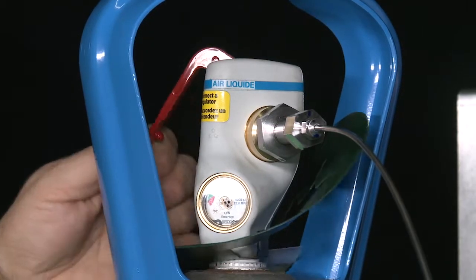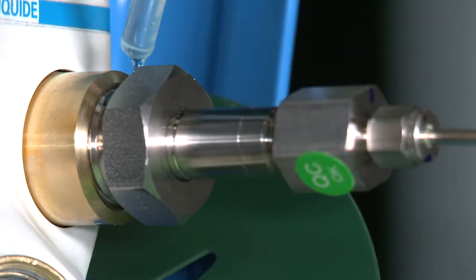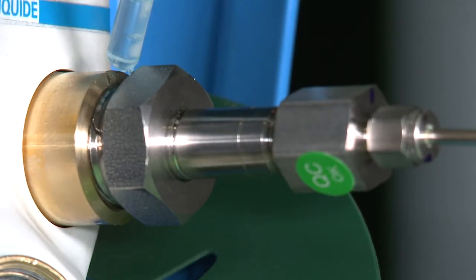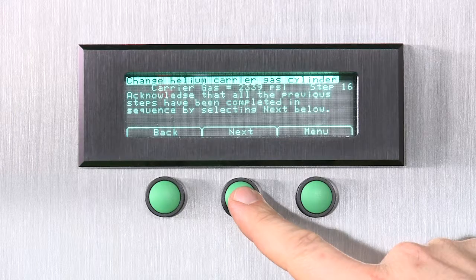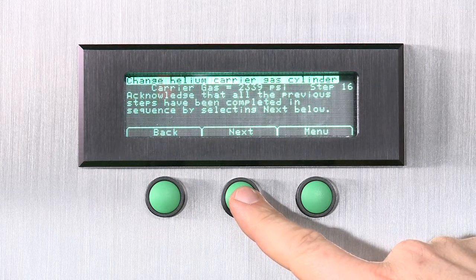Open the shut-off valve on the cylinder. Use Snoop Liquid to check for leaks at the gas fitting on the cylinder. Acknowledge that all the previous steps have been completed in sequence by selecting Next.